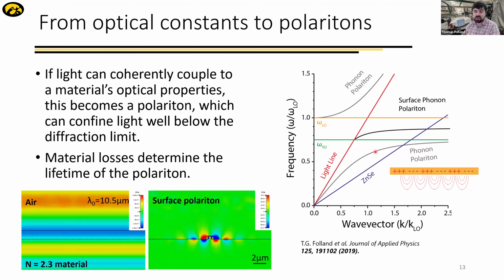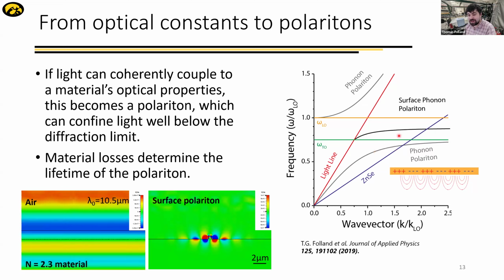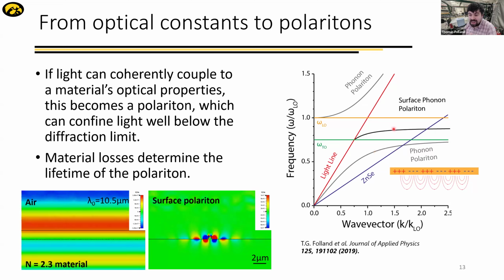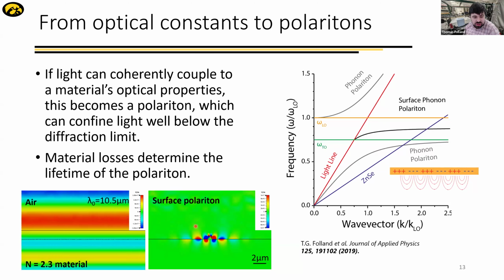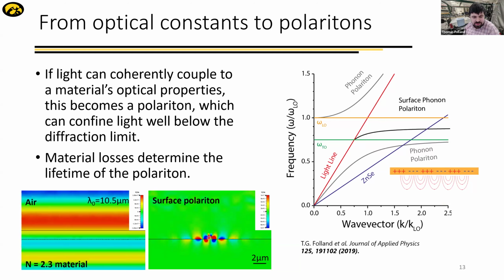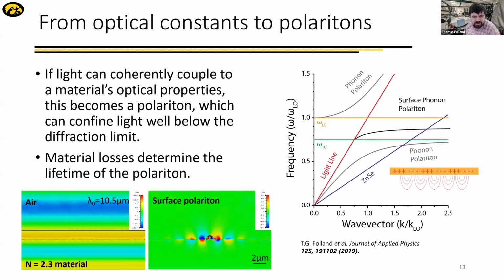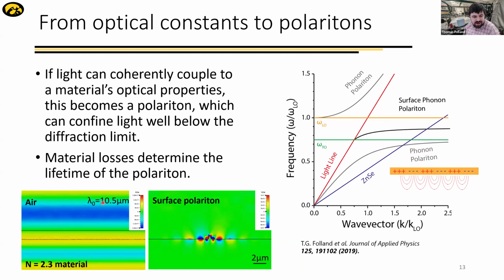And this is actually really powerful, because if we can trap light into small dimensions, so instead of say we have 7 micron light, instead of being 7 microns, we can make this light wave with a polariton that's, say, 200 nanometers in wavelength. We can obviously see and monitor much smaller changes in the material, as well as also use that for different types of photonic devices. So these surface waves actually look like this. This little animation of them scattering. You can see the waves scattering out along the surface. You can see they're very, very much smaller than the wavelength in free space, which is shown on the left.